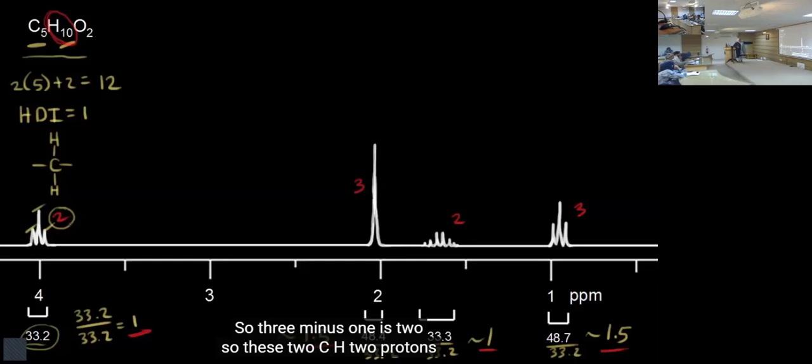We are talking about the proton resonating at 4 ppm. It's 2 protons and it's a triplet. So 2 protons means it's a CH2. But triplet means the neighboring also has 2 neighbors. Exactly.